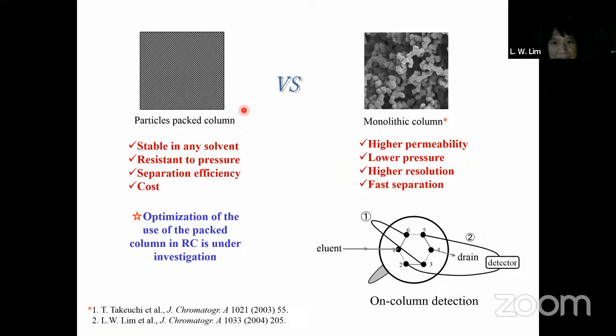When we use C18 to detect samples with oily and fatty characteristics, is it correct? When you have oily and fatty compounds inside, you have to filter the sample before you put it in the C18. If you want to separate some compounds using C18, it is okay.